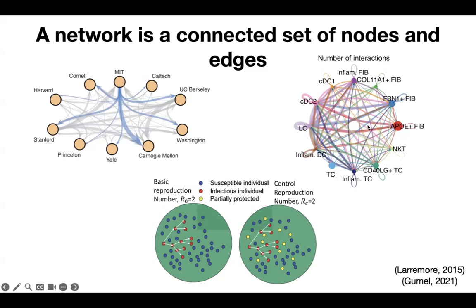And then you can see the lines in between these cell types are actually the interactions between these cell types. So a thicker band indicates that these two cell types are more likely to be interacting with each other than a thinner band between two cell types.